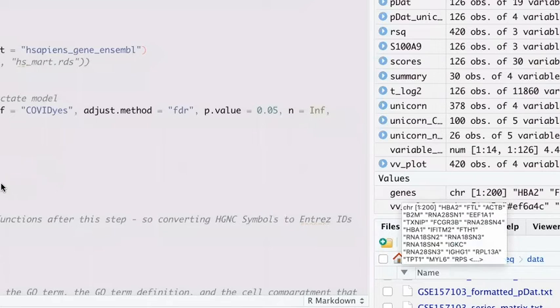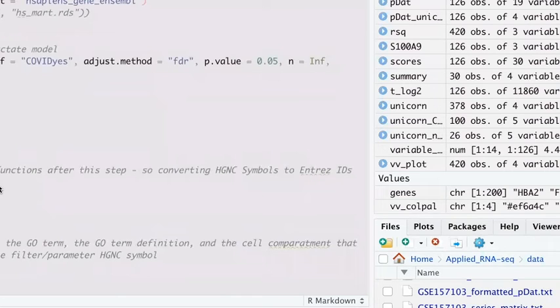And when we're actually running biomaRt, there's a lot of attributes or filters you can apply to get the information that you want. So what we're going to do is convert our gene names to actually Entrez IDs, because Entrez IDs, Ensembl gene IDs, all of these IDs are used for very specific functions. One won't work for the other. So when you're working with genomic data, unfortunately, this is something that you'll have to do a lot, converting between different gene IDs.